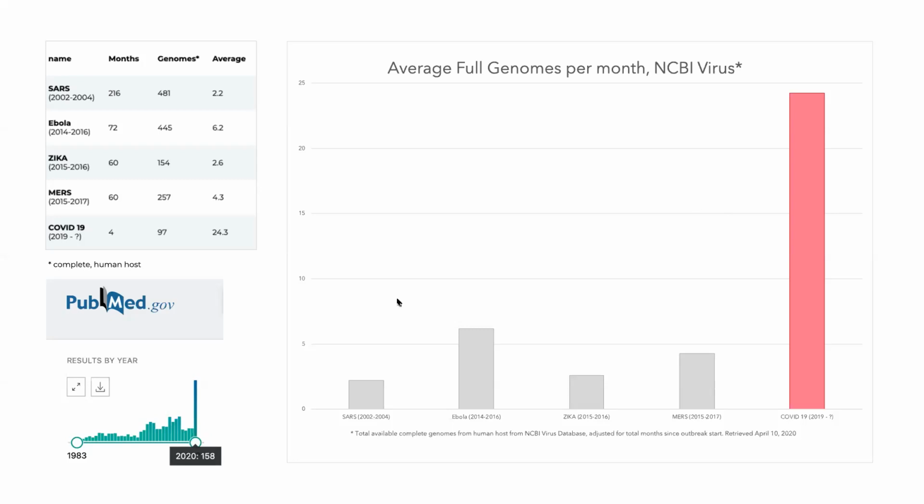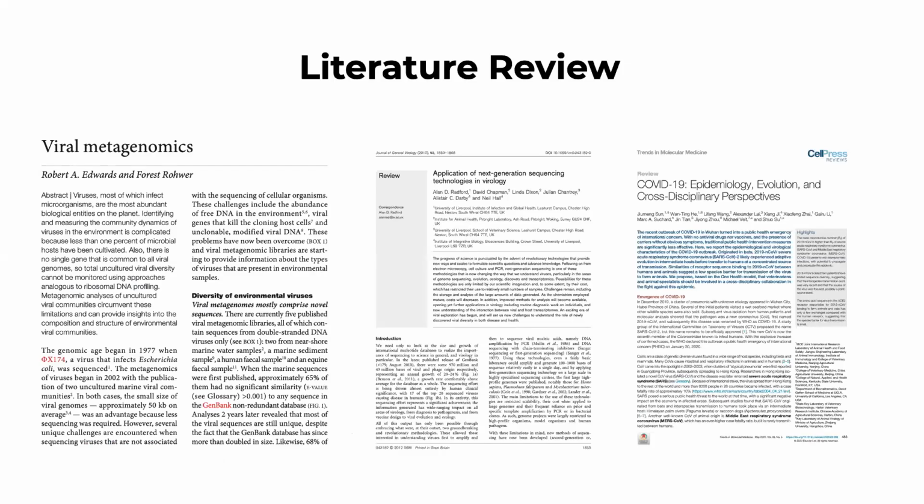We talked about that also yesterday when we talked about the submissions on PubMed for all coronaviruses. You can see that suddenly there's a spike in coronavirus articles with data, 158 in 2020 alone. You can see that is almost double from ever before. So this is an interesting pattern, and one of the key technologies to have more data about these viruses is next generation sequencing. So in fact, this is called viral metagenomics. So we are talking about sampling directly from environment or directly from a human.